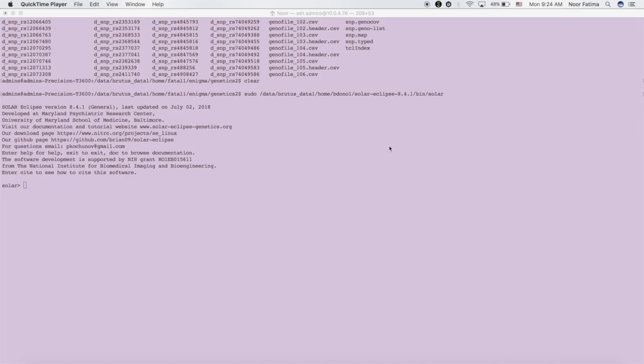There are 3 ways to do a GWAS analysis for a single trait. To run the analysis, however, you need to be able to read the SNP ranking for each individual into the command, which you can do one of 2 ways. The first way to do this is by reading in the plink files .bed, .bim, and .fam, which have the SNP data by adding the argument -plink and the base file name, like this, in my case external, which you will use in conjunction with the GWAS command. Or, if you have the SNP data in your phenotype file, you do not have to add any additional arguments.